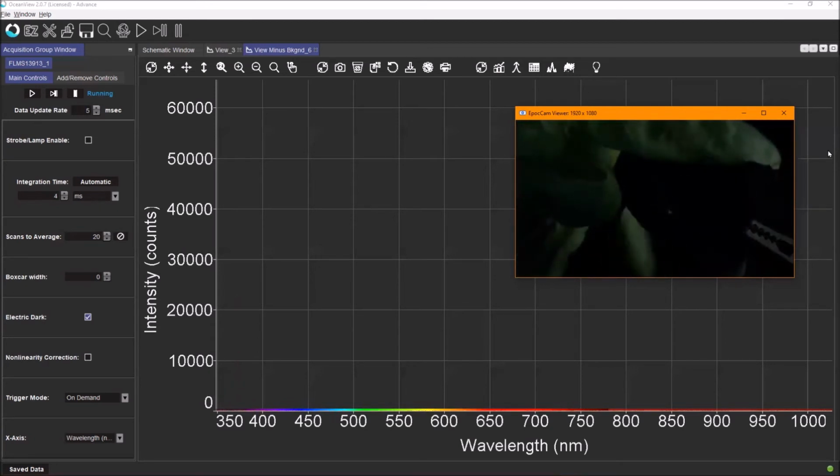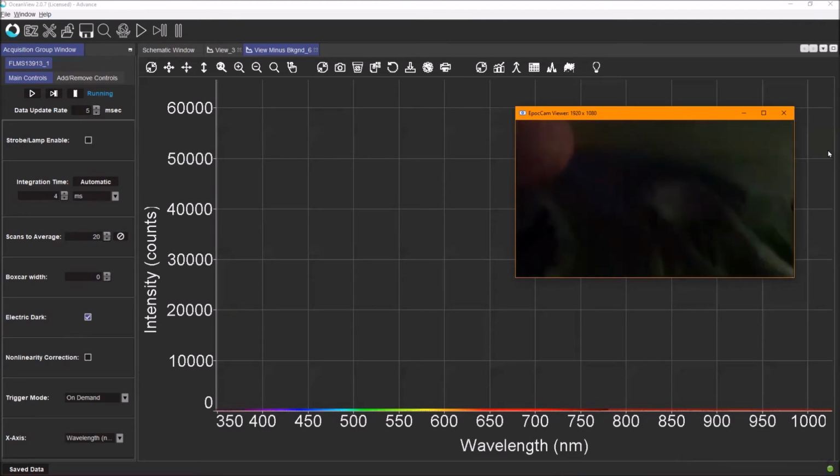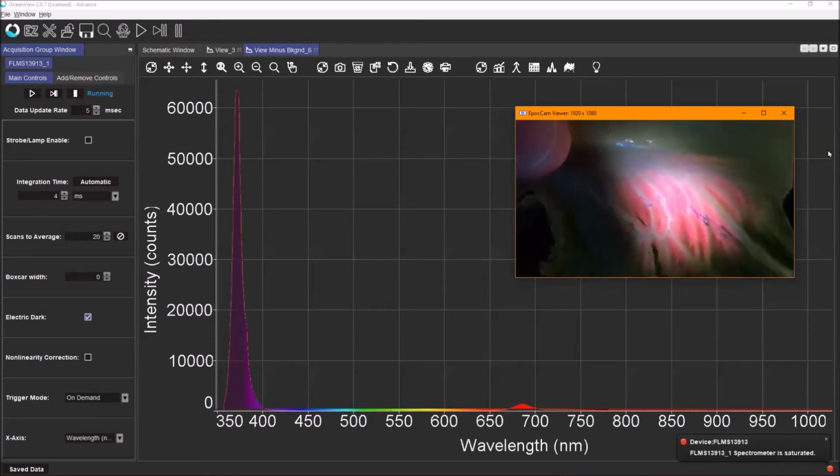Very interesting. I can do the same thing with lettuce. So here's a leaf. I expose the UV light. You can see the red coming out. You can see the peak in the spectrum as well.